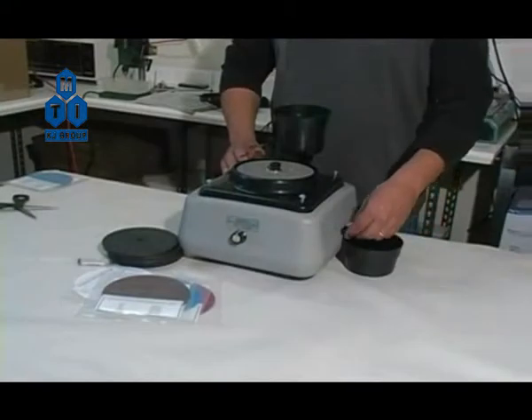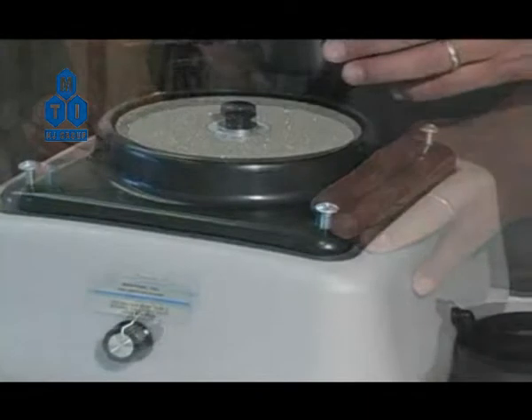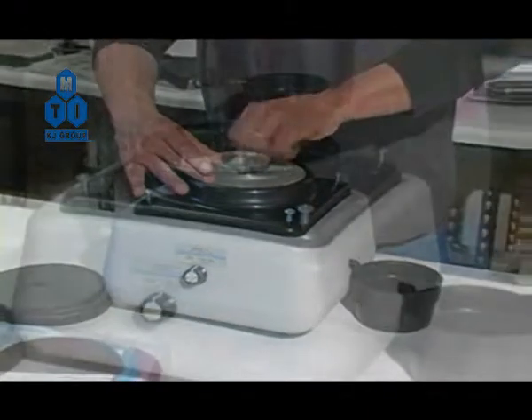Place the coolant receptacle under the drain spout on the right side of the machine. Use the corners of the water guard to raise, lower, and level the water guard if necessary. The water guard should rest just slightly above the level of the grinding disc surface.